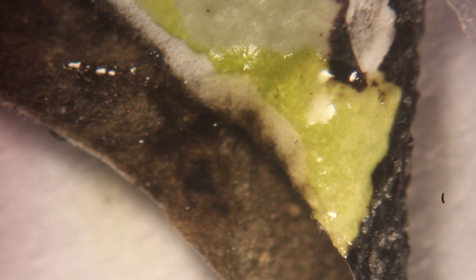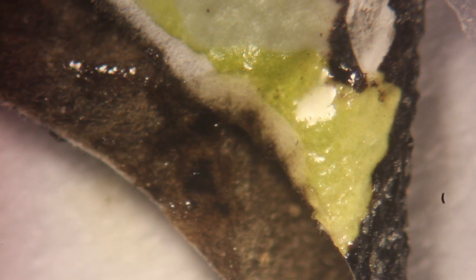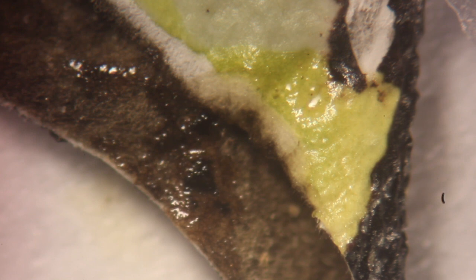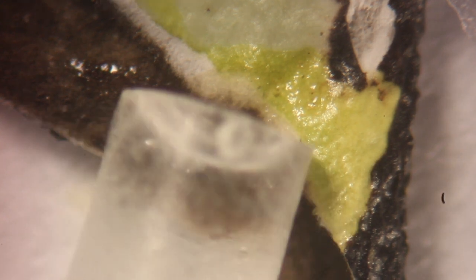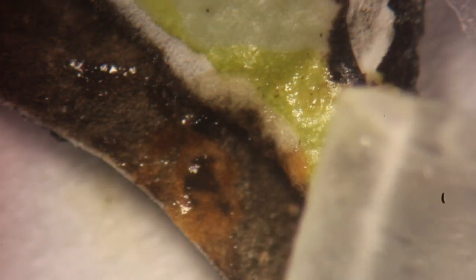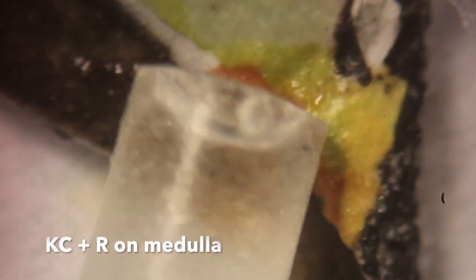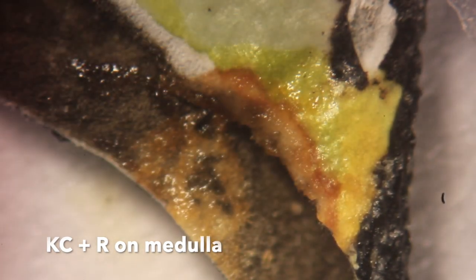This is pretty common and something you might want to look out for, as some of these reactions are pretty quick and can fade pretty quickly also. The KC reaction we're looking for is on the medulla, and you can see a quick change to red. This reaction will also fade, but much more slowly.